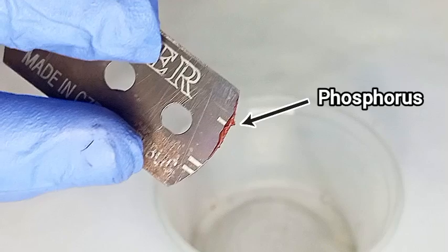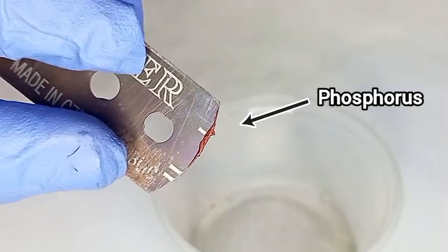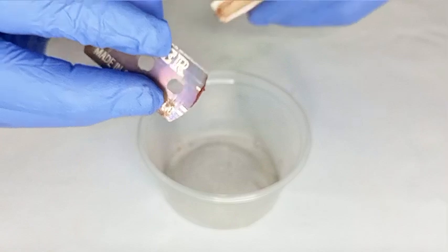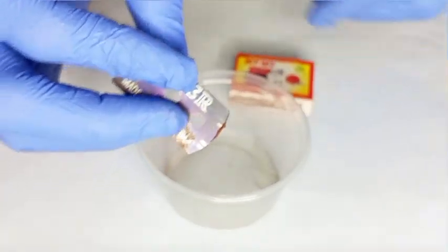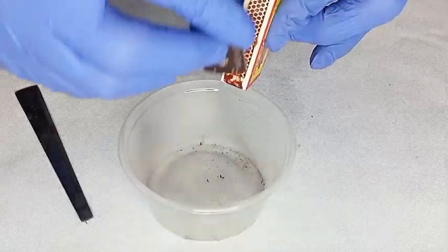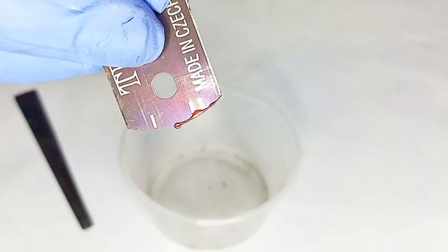This is our target. This tiny smear is all the phosphorus a single striker pad gives us, so it's clear that we will need a lot of boxes and even more patience to get a usable amount.